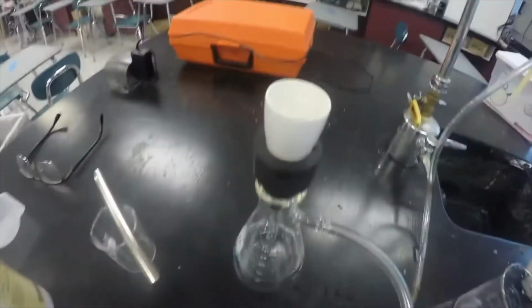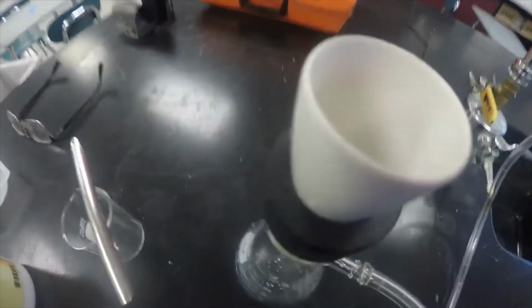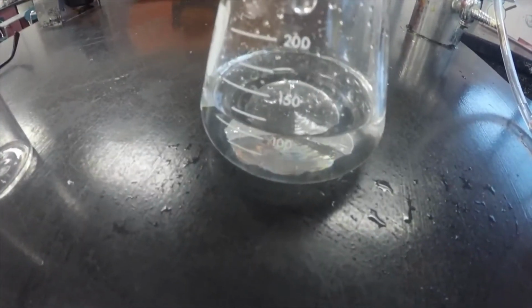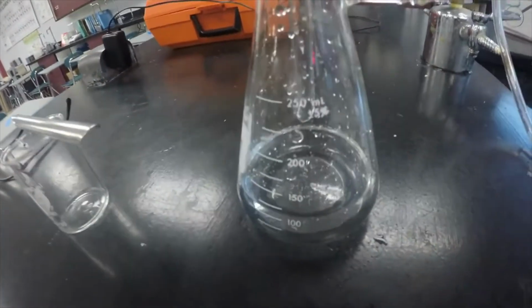Okay, so the process is more or less complete. You might see that I have some solid that is wet inside of the Gooch crucible. The liquid underneath is relatively clear. It wasn't initially. I noticed some turbidity in the mixture at the bottom, which suggested to me that some of the calcium carbonate was being pulled through. But then I filtered it again, and filtered the mixture at the bottom, and was able to recover any lost calcium carbonate.